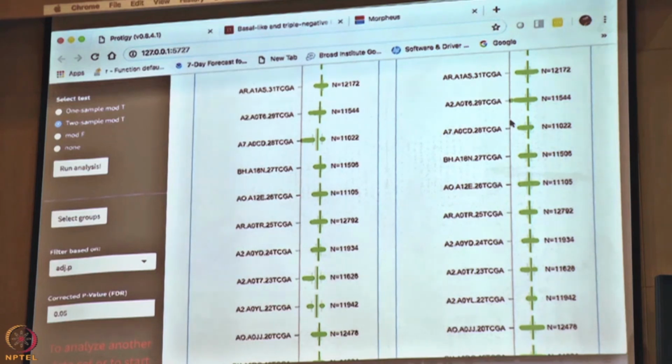So you can get a feel for whether there are samples that you had to use extreme normalization factors to get them to agree with all the others. In that case, you might want to see whether those samples had any issues, or if there was less material for that sample for whatever reason, or if those samples just didn't work out, they failed for some reason. If you can show that they failed for whatever reason, you can throw that out and do your analysis.